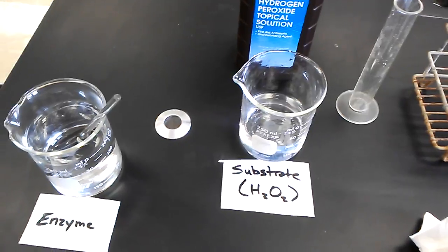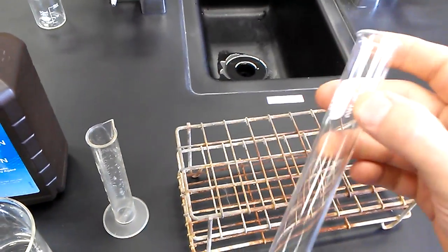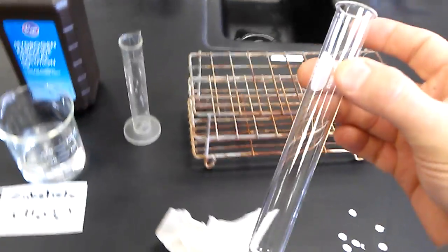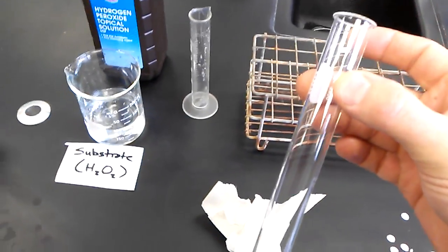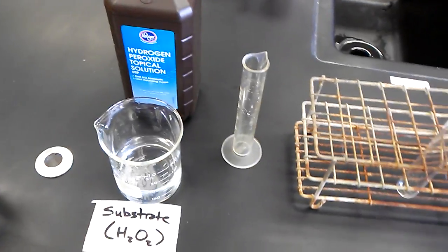Your directions will call for you filling a test tube, seen here. This test tube you are going to add 20 milliliters of your substrate to. So we're going to pour 20 milliliters of substrate into our graduated cylinder, and then we're going to add that to the test tube.